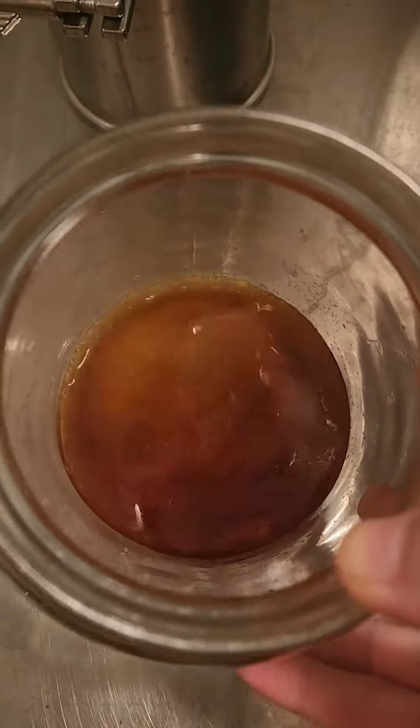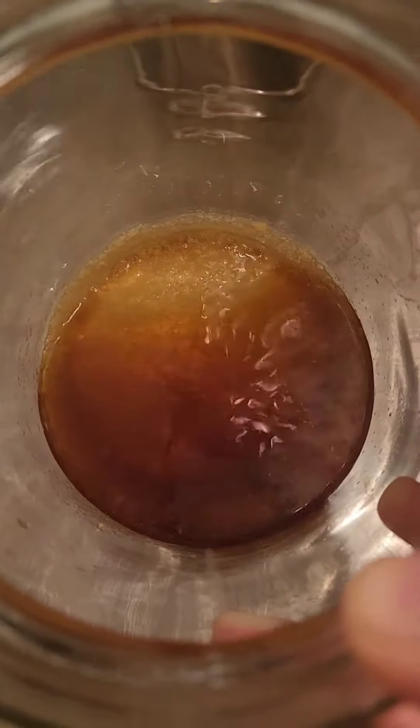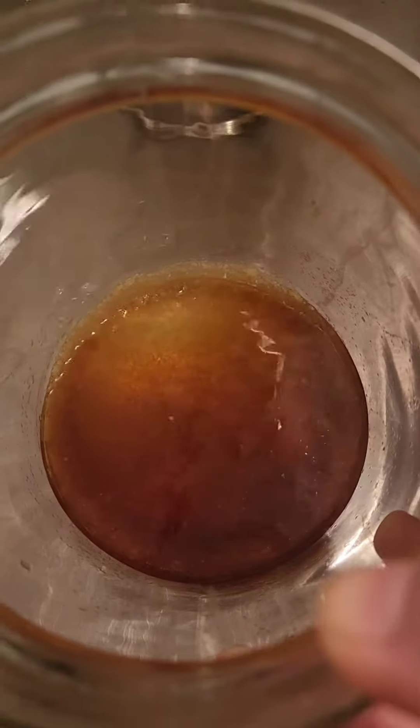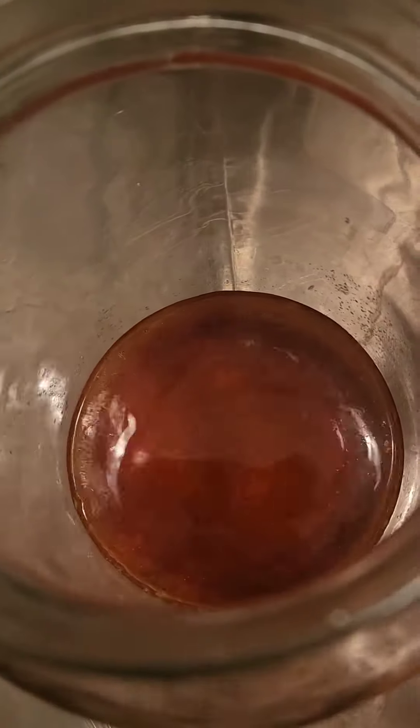This is the alcohol extraction of maitake mushroom. Just like many mushrooms and some plants too, whenever the alcohol extraction cools down there is a clumping — not crystals, but sugars. These are various polysaccharides.